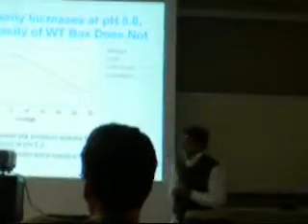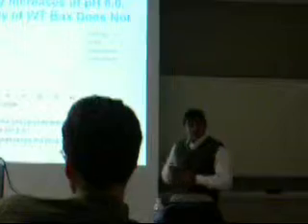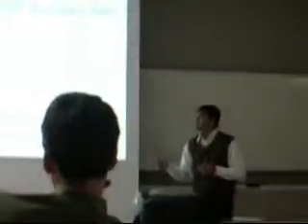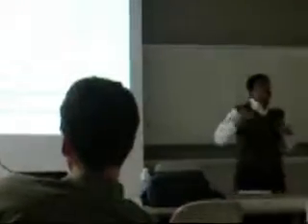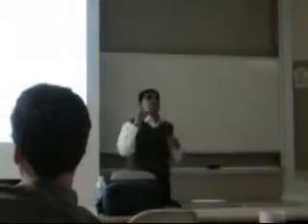So this spectra indicates the fluorescence intensity of K64A and BAX at pH 8. Now, in all my data, black curves indicate the fluorescence of wild-type, and the red curves indicate the fluorescence of K64A mutant. So here you can see that at pH 8 for wild-type BAX, there's no difference between the spectra, whether the lipid is present or not. The spectra doesn't change a lot. So at pH 8, the fluorescence intensity does not increase with respect to the lipid.